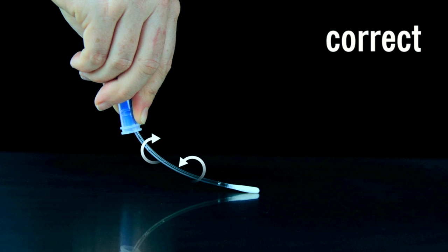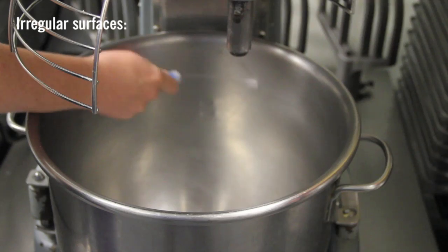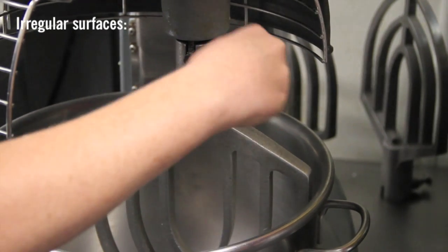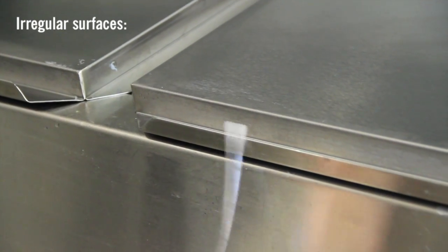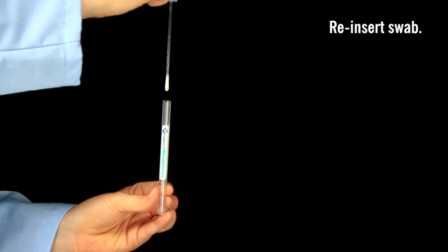Rotate the swab tip while collecting sample to ensure maximum sample collection. When swabbing an irregular surface, ensure the swabbing technique remains consistent and swab a large enough area to collect a representative sample. Replace the swab in the tube.